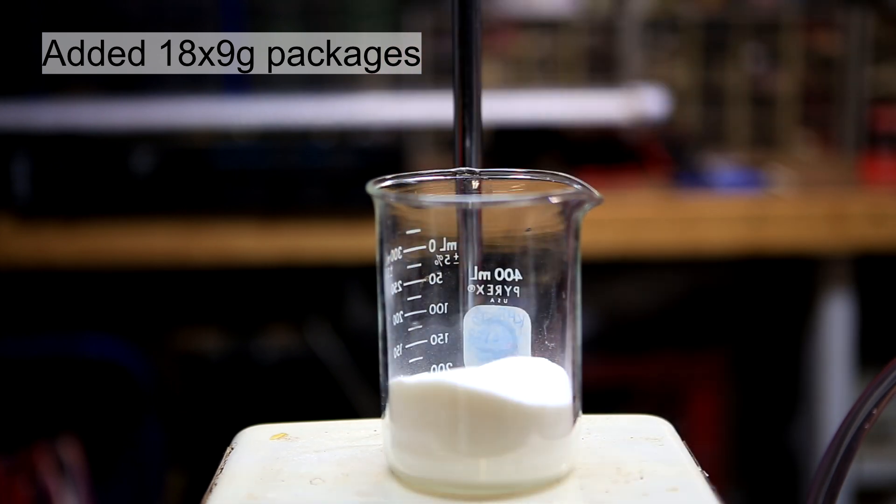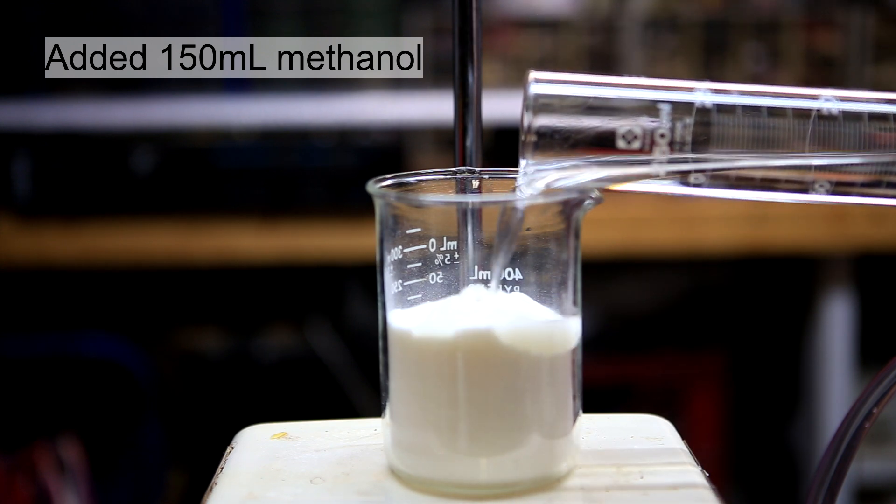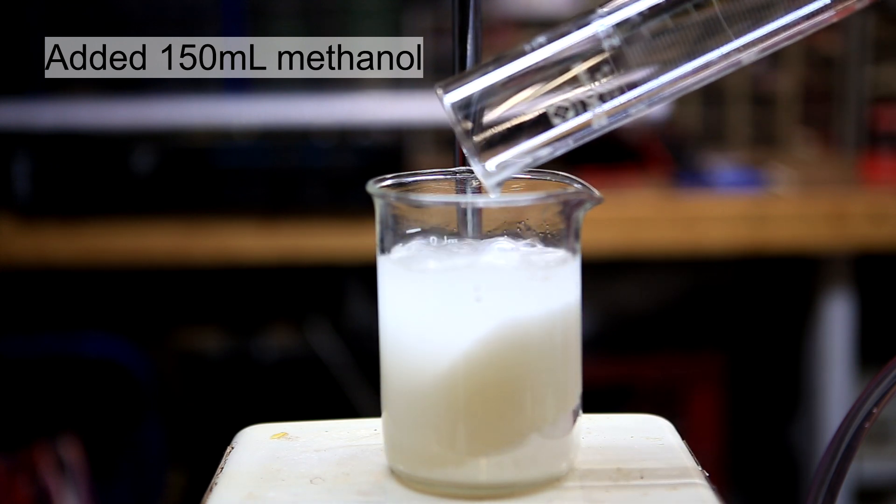18 packages containing 9 grams each of vanilla sugar were poured into a beaker. To this was added 150 milliliters of methanol. Methanol is used because vanillin's solubility in methanol is quite good, but the solubility of glucose and other sugars in methanol is quite poor.